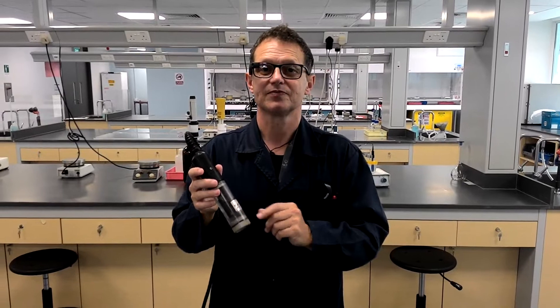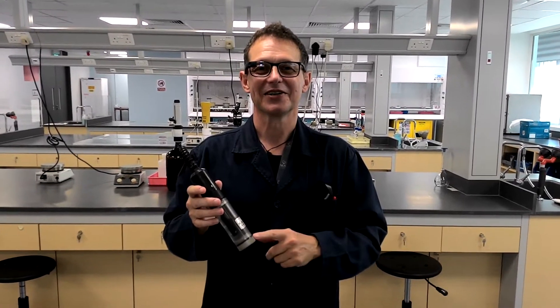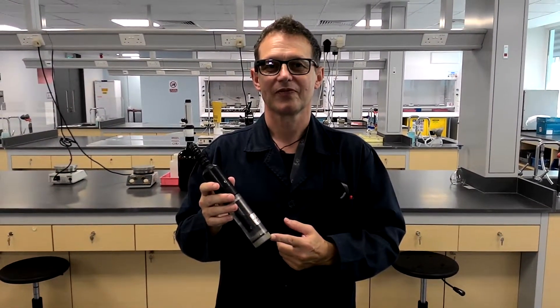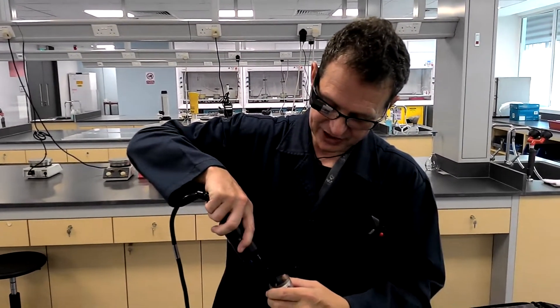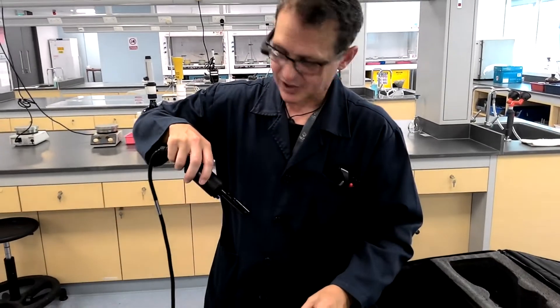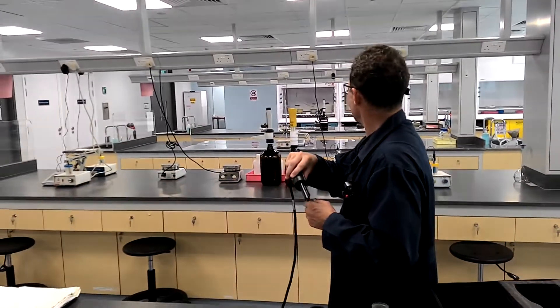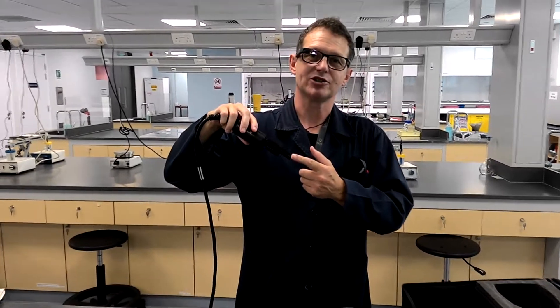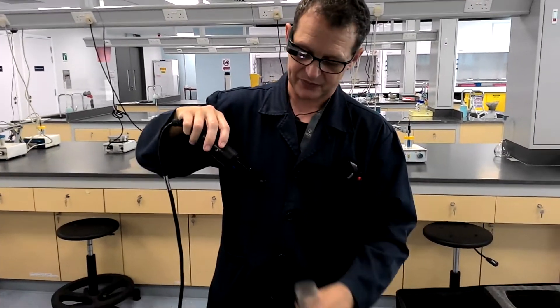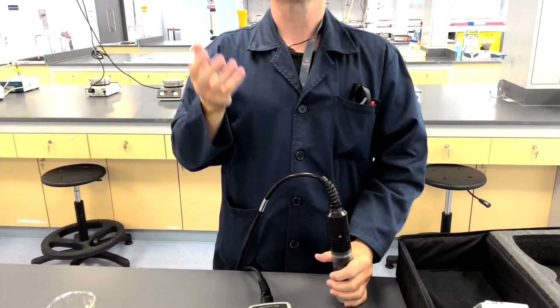I see. To prevent that problem. OK. So if it was stored in air instead of saline, there won't be any diffusion of ions, isn't it so? Right. Then there is a different problem. I can't, I'm looking round to see and I can't see any in the lab. Any laboratory, you'll find old pH electrodes. Because if you store them dry, which you must never do, two things happen. Three things happen.